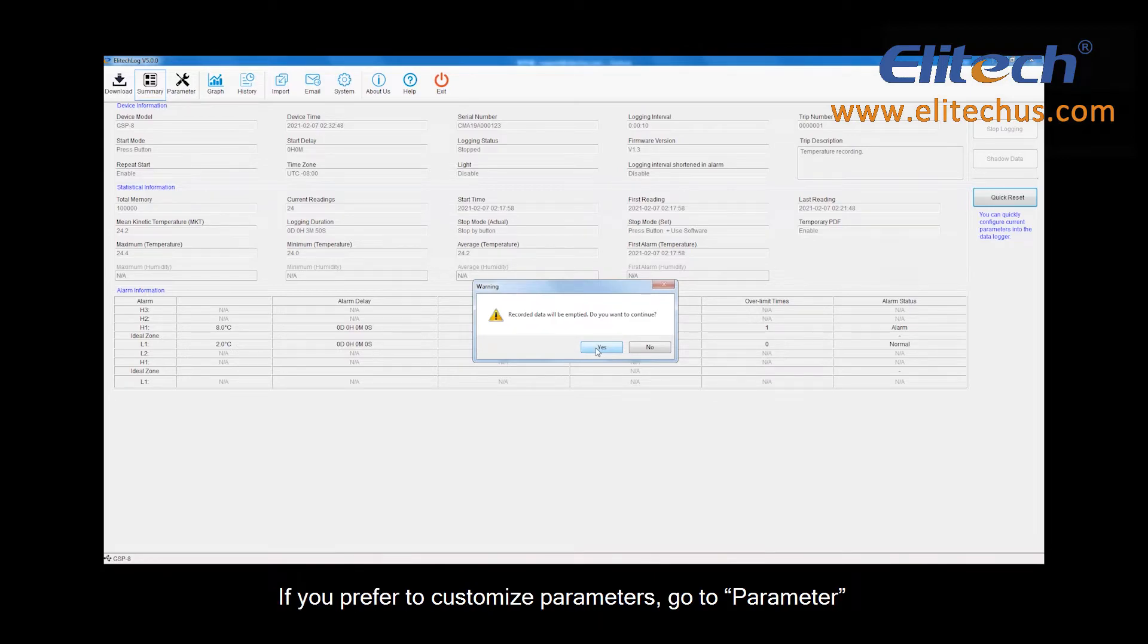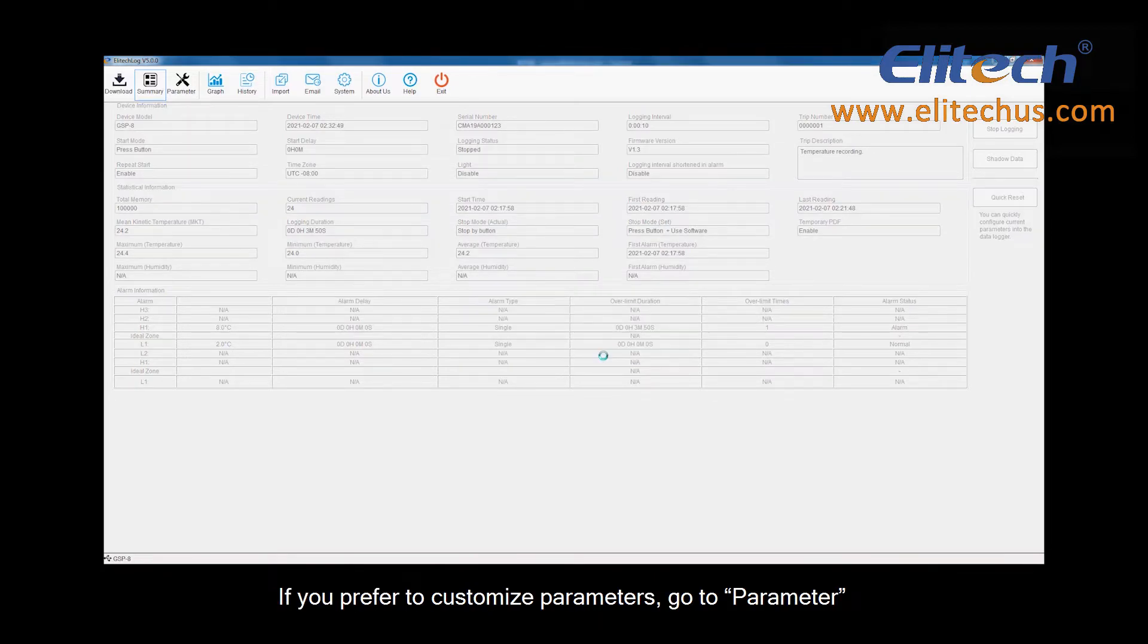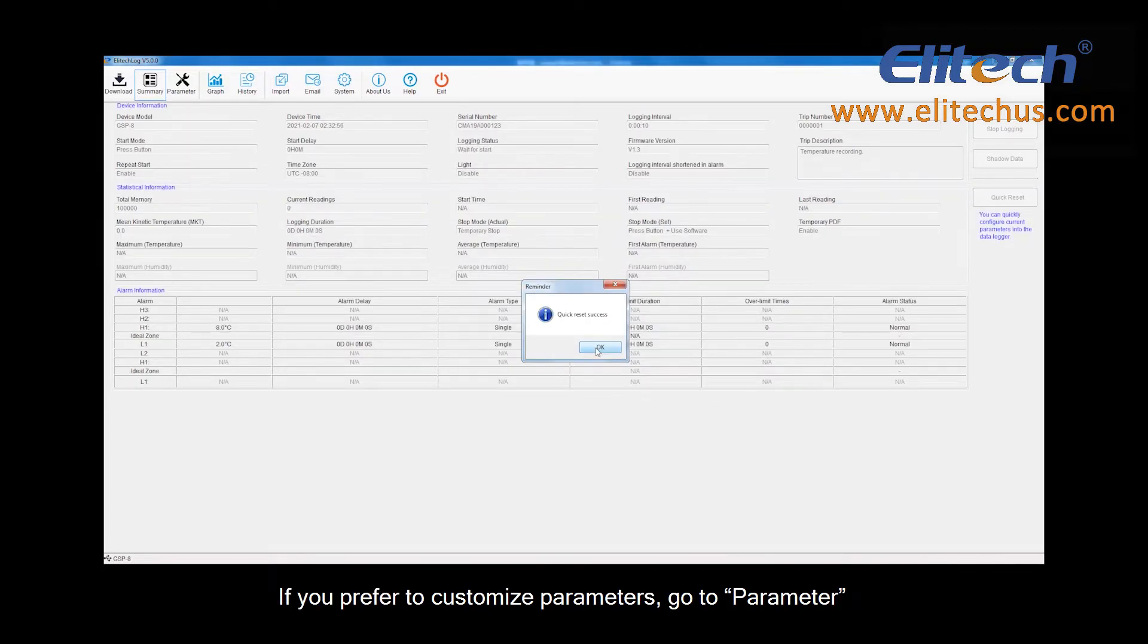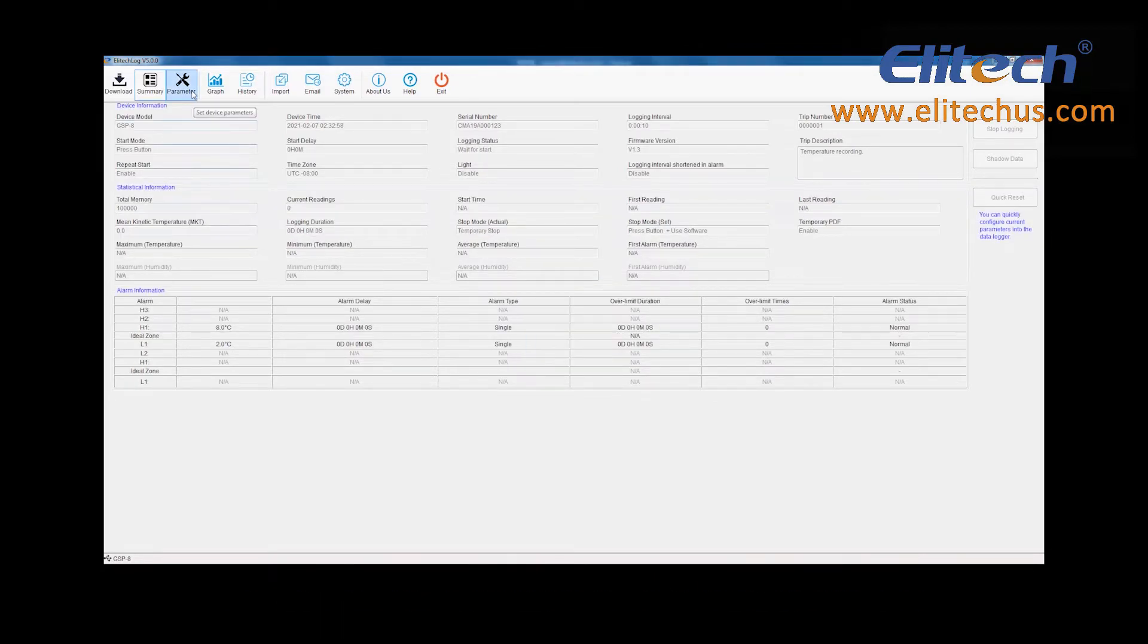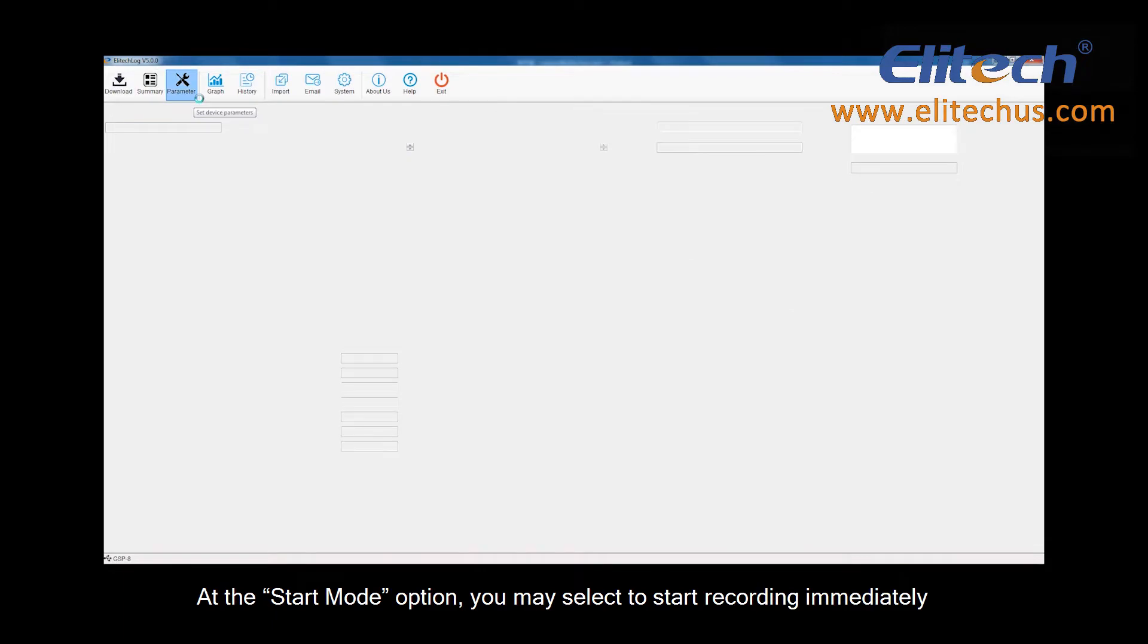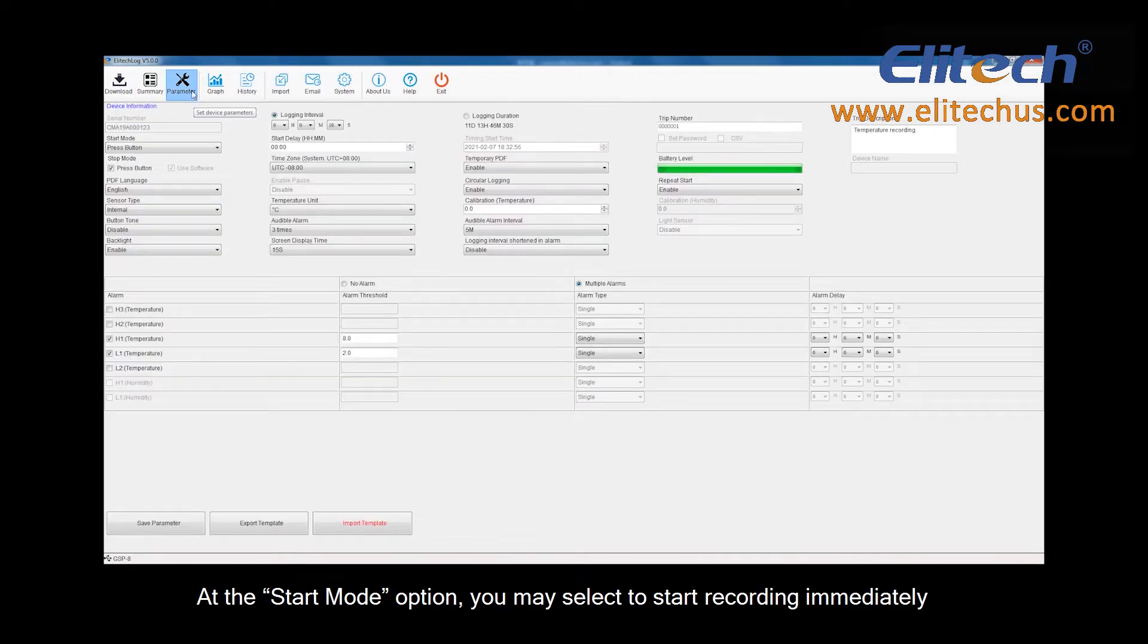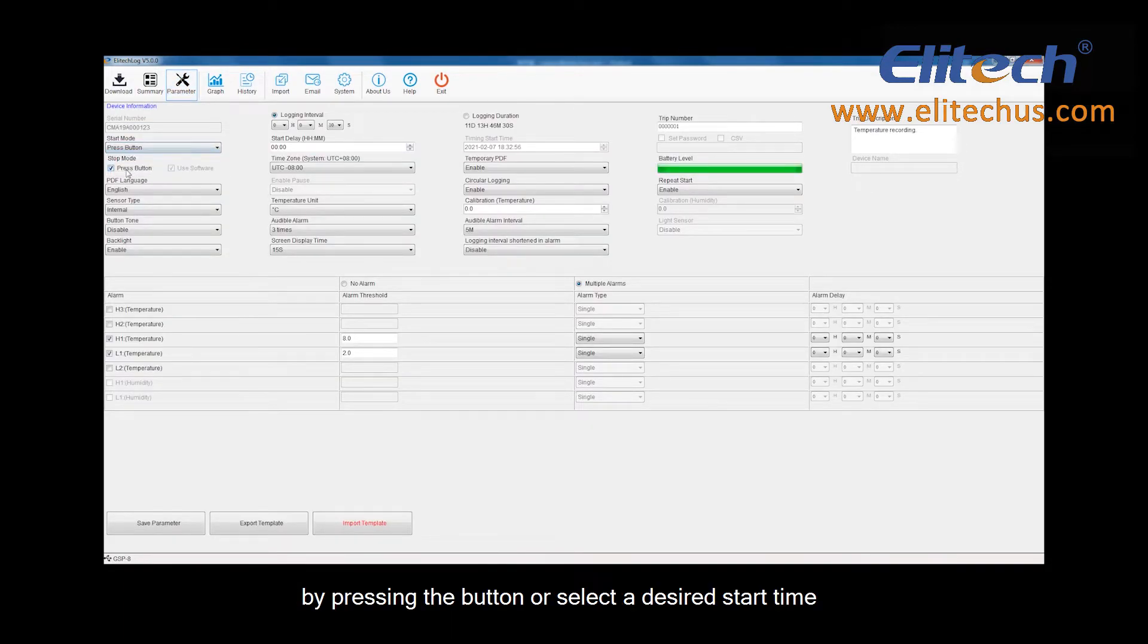If you prefer to customize parameters, go to Parameter. At the Start Mode option, you may select to start recording immediately by pressing the button or select a desired start time.